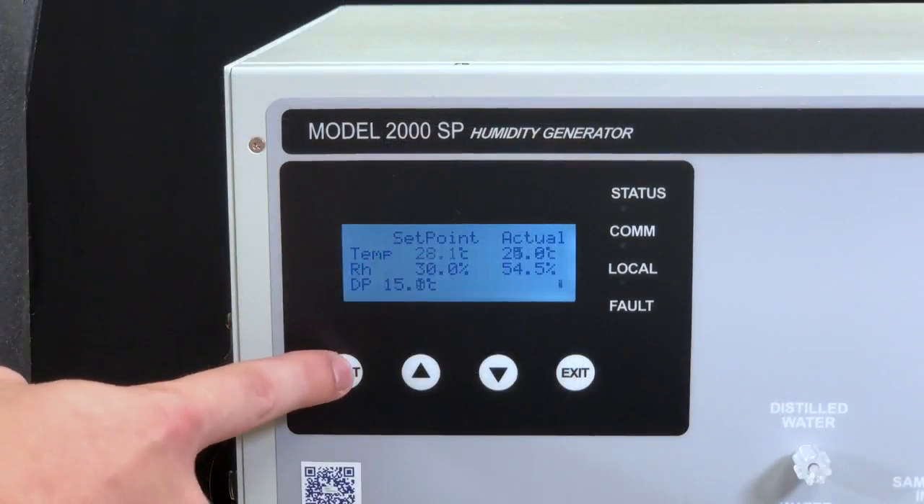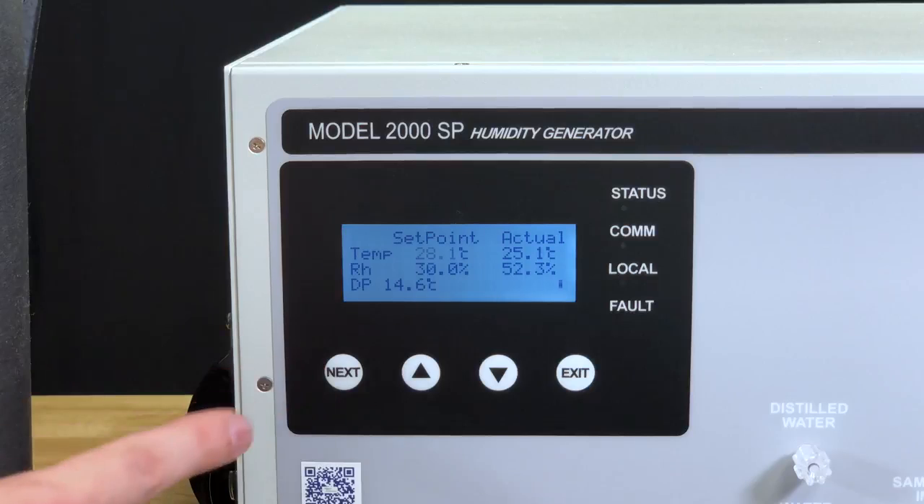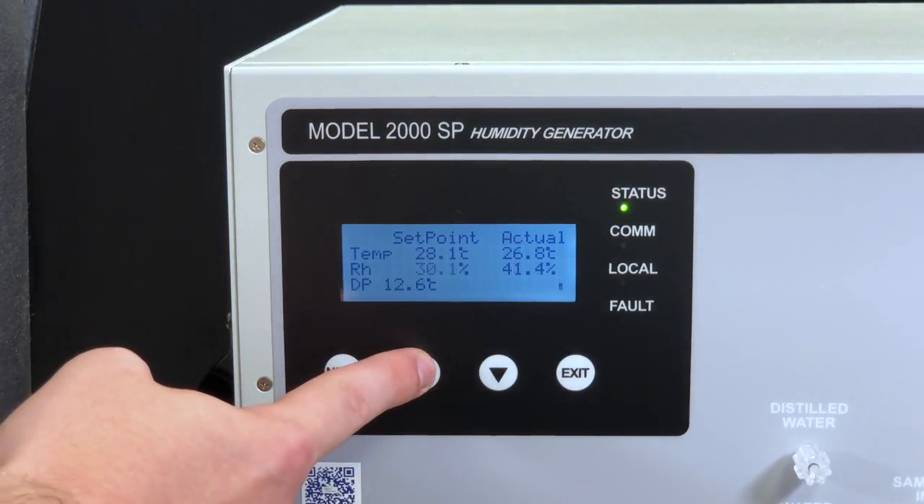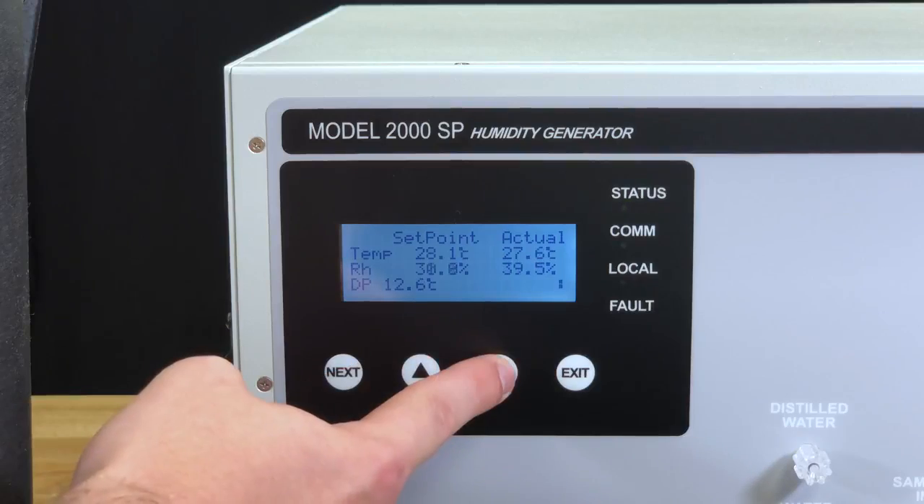At this point, you can move to the controller and press the next button to toggle between humidity and temperature. Once you've selected your field, press either the up or down keys to adjust the unit set points.